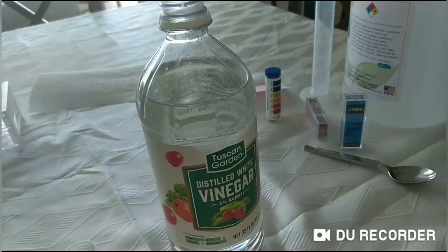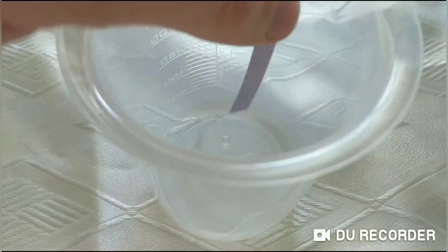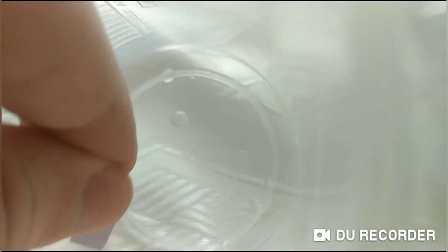Here I have the vinegar and I've measured one milliliter. I'll put that in this beaker and test it. Testing with the red litmus paper — it stays red, so I'll write that down. For the blue litmus paper, it turns red.